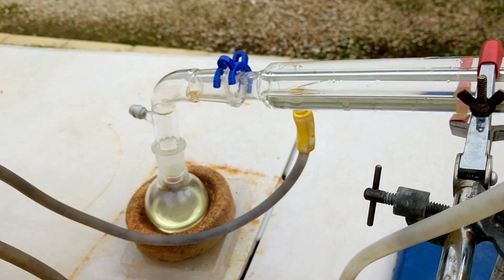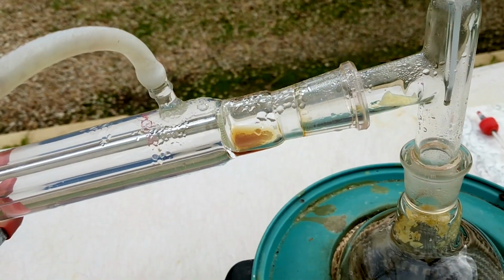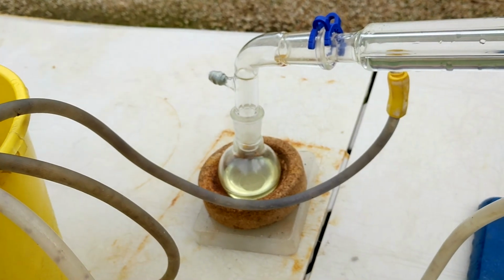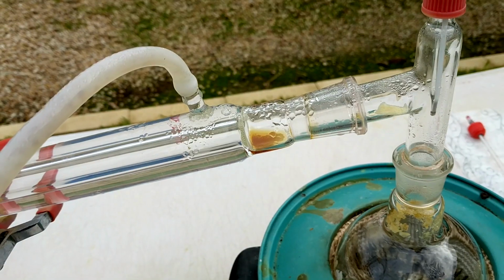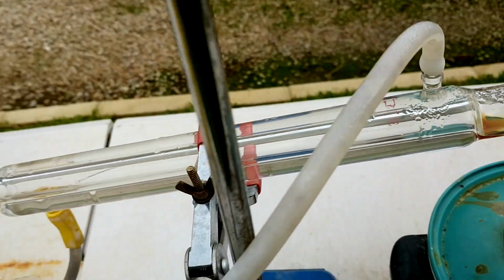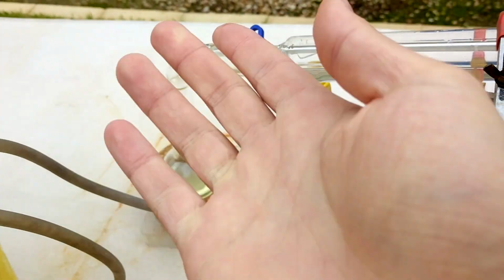We can chemically clean that up. We just have to add some sodium hydroxide to it, and that will lower the vapor pressure of the niacin by turning it into a salt. Yeah, and then that won't come over with the second distillation at all. So that'll be fine. Really not too much of an issue. It's just a lowering of the yield issue.